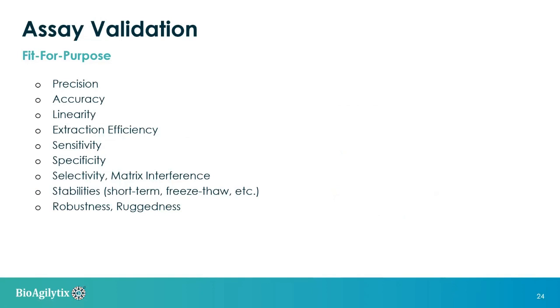So as I mentioned, there's no validation guidance that is available for PCR. So the validations are fit for purpose, and they are similar to any other bioanalytical or analytical method validation, where the performance of the assay is characterized first by understanding its reproducibility, linearity, specificity, matrix interference, robustness, and stabilities for your method. So this is common across most methods in regulatory analysis.